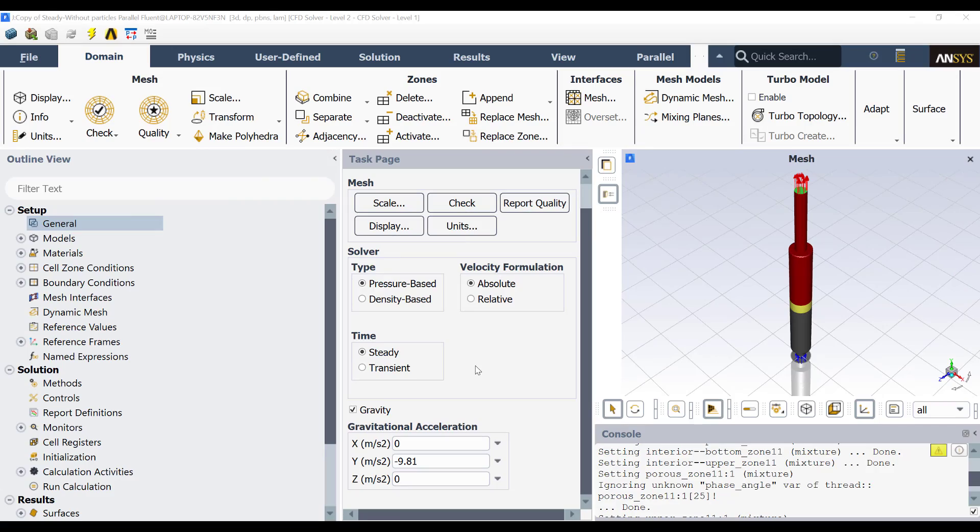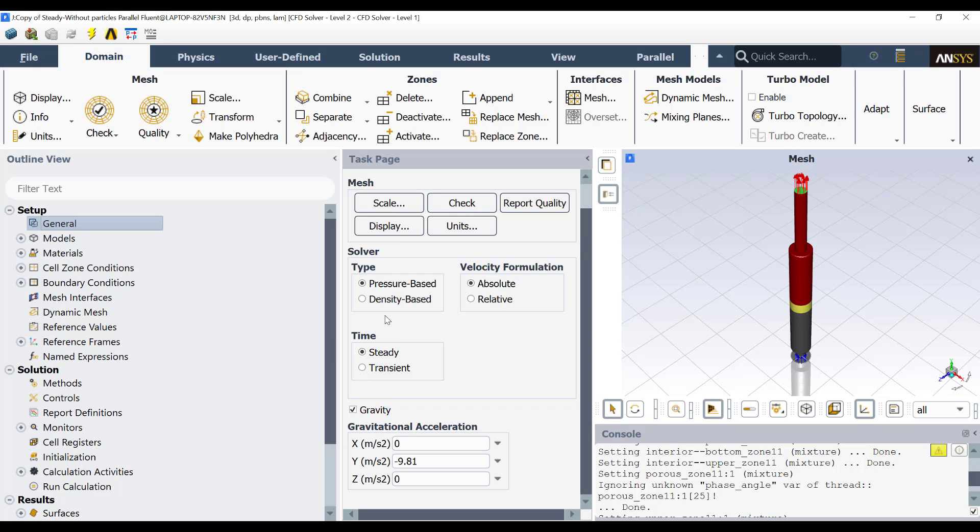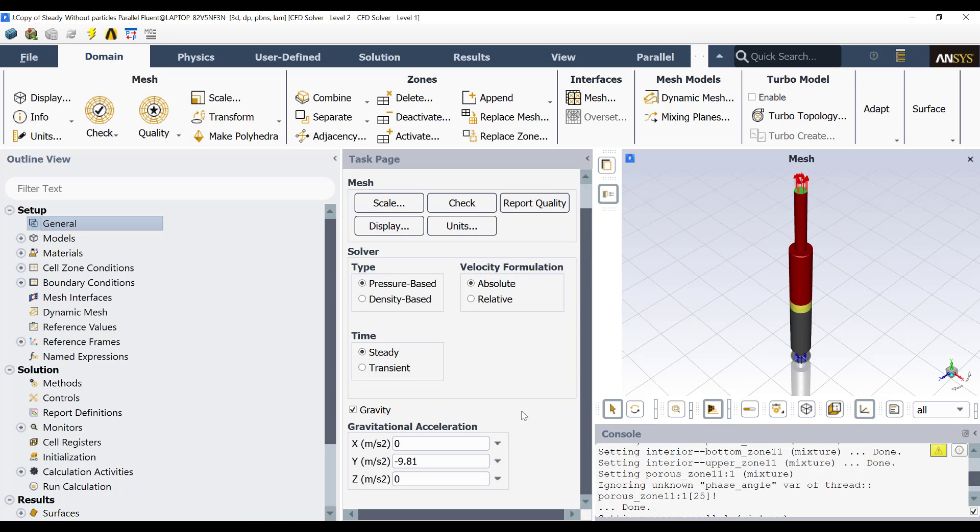Once the mesh is performed, then we need to go into Fluent. Then we are here in the setup of Fluent. If we double click here in general, we will see that we have a pressure-based solver and steady-state formulation. I have enabled the gravity because when I am going to inject particles, then this will be a multiphase flow. Then the gravity has an important impact over the bioreactor performance.